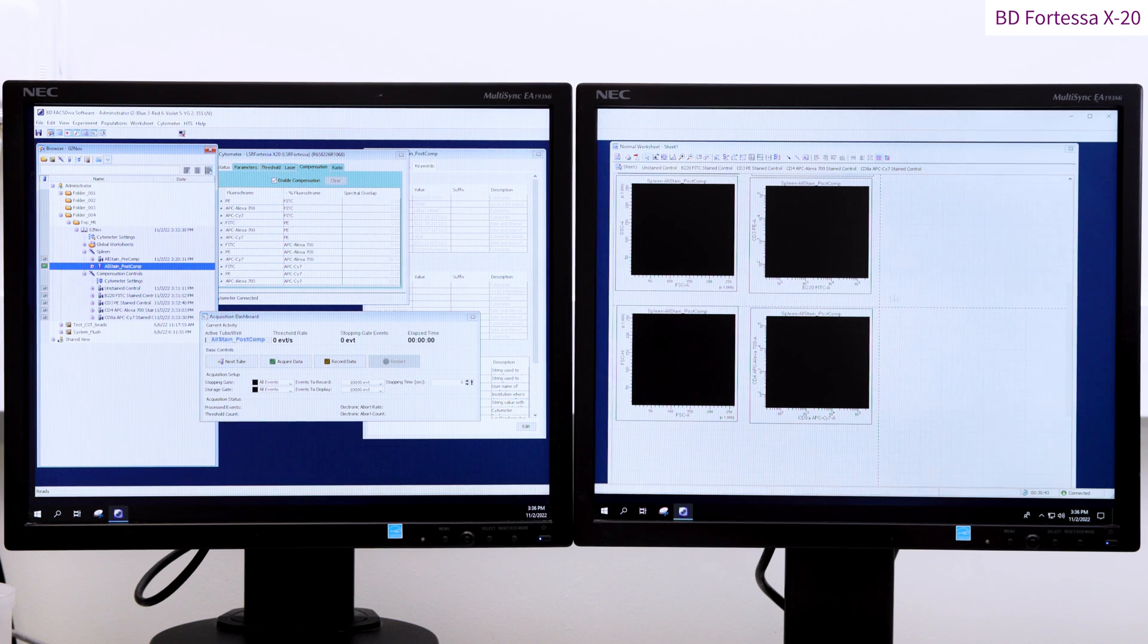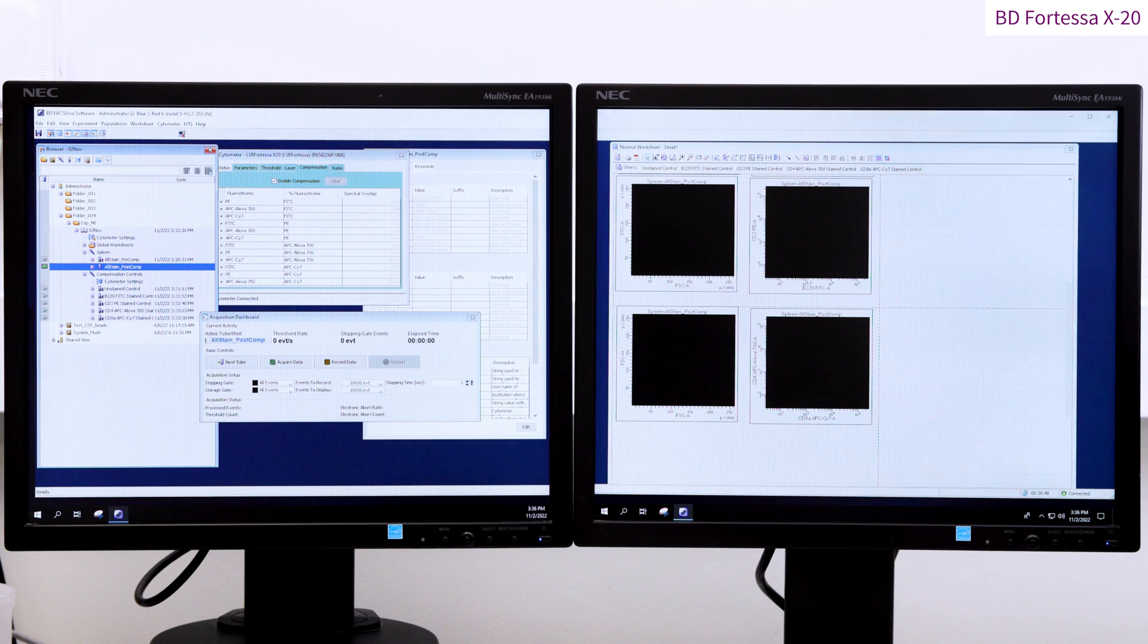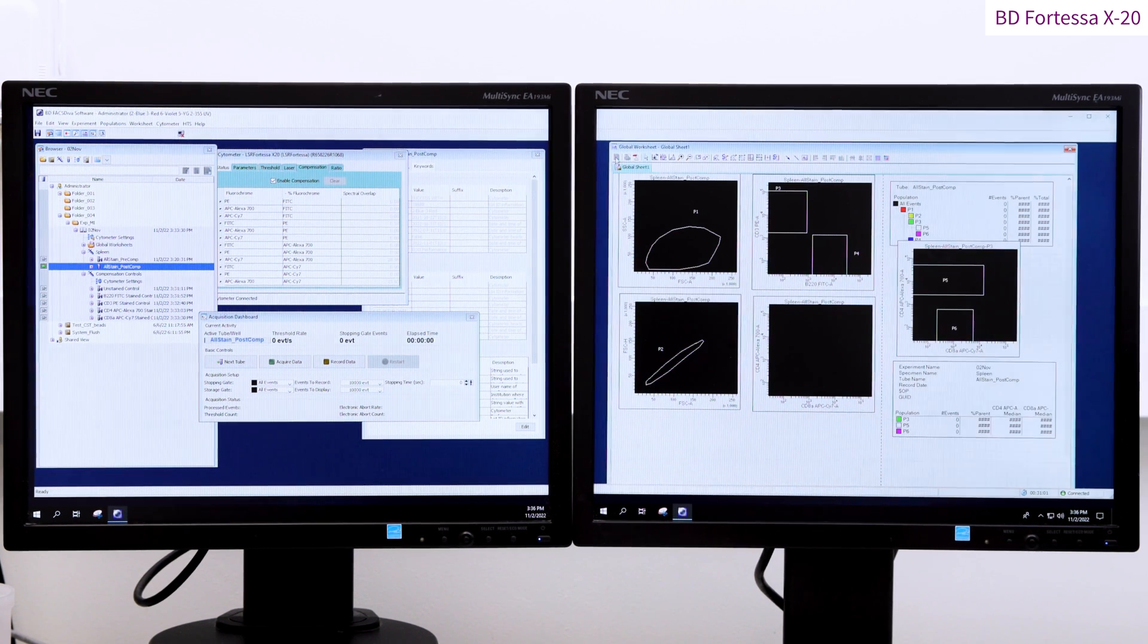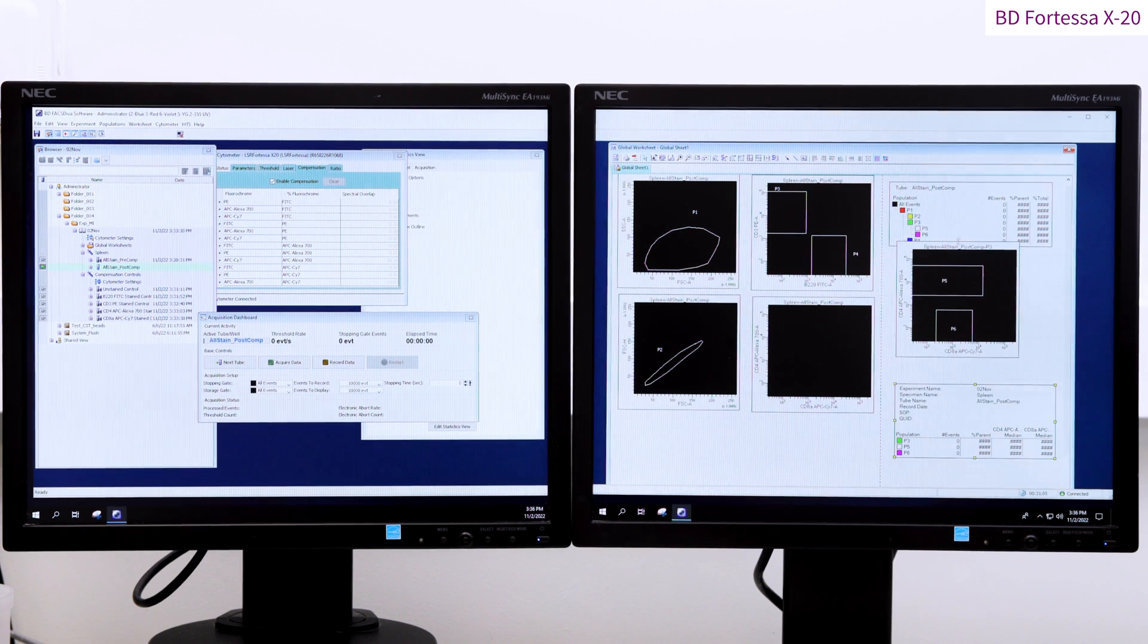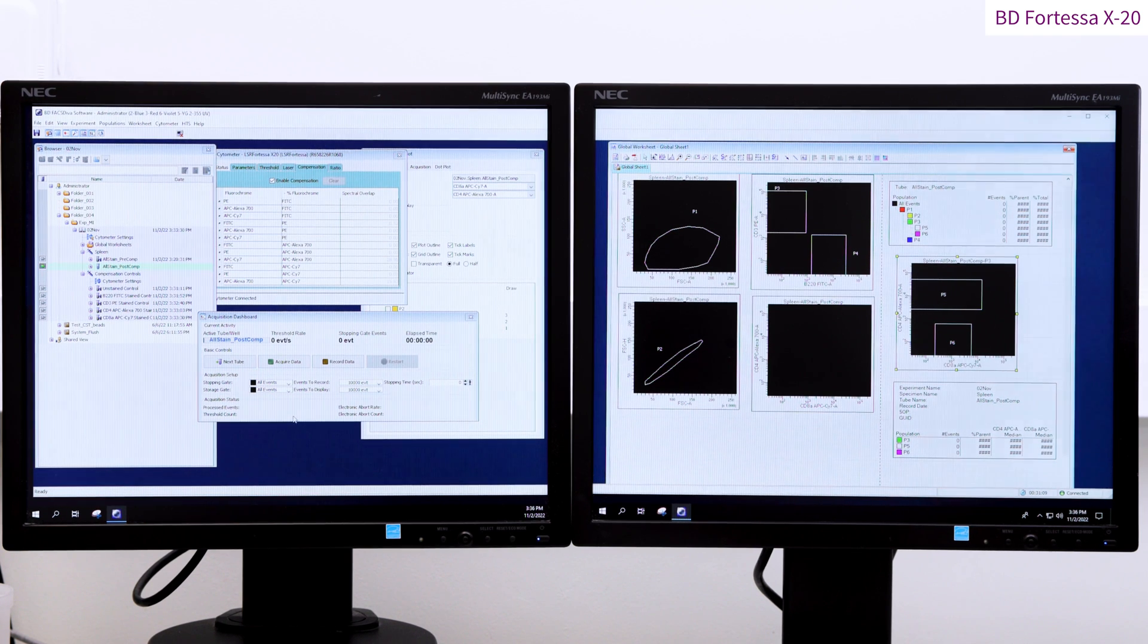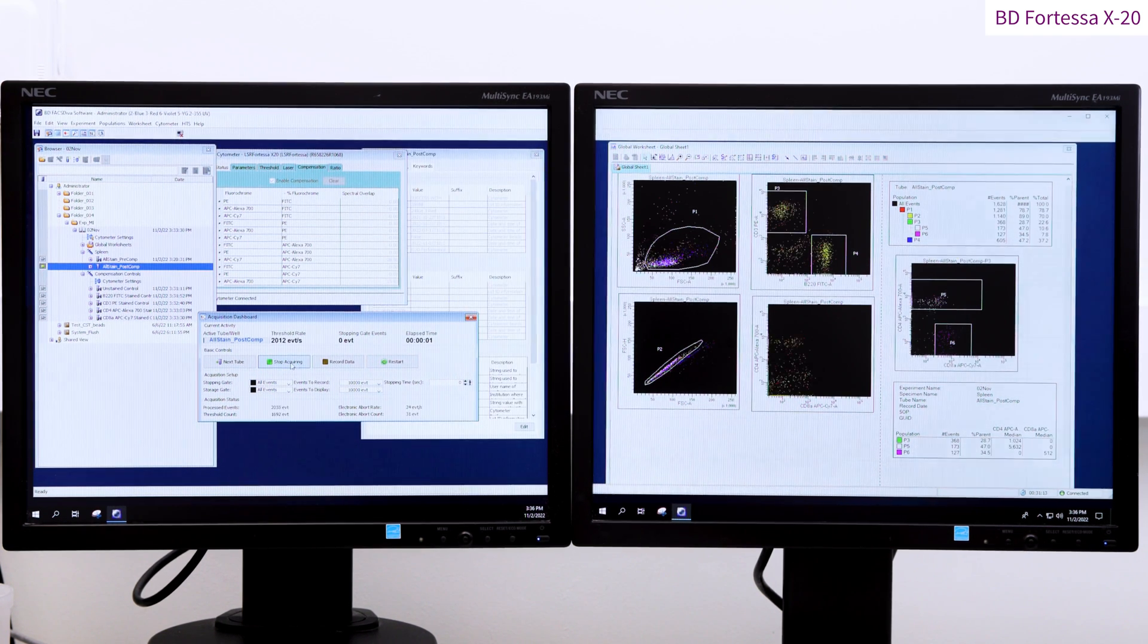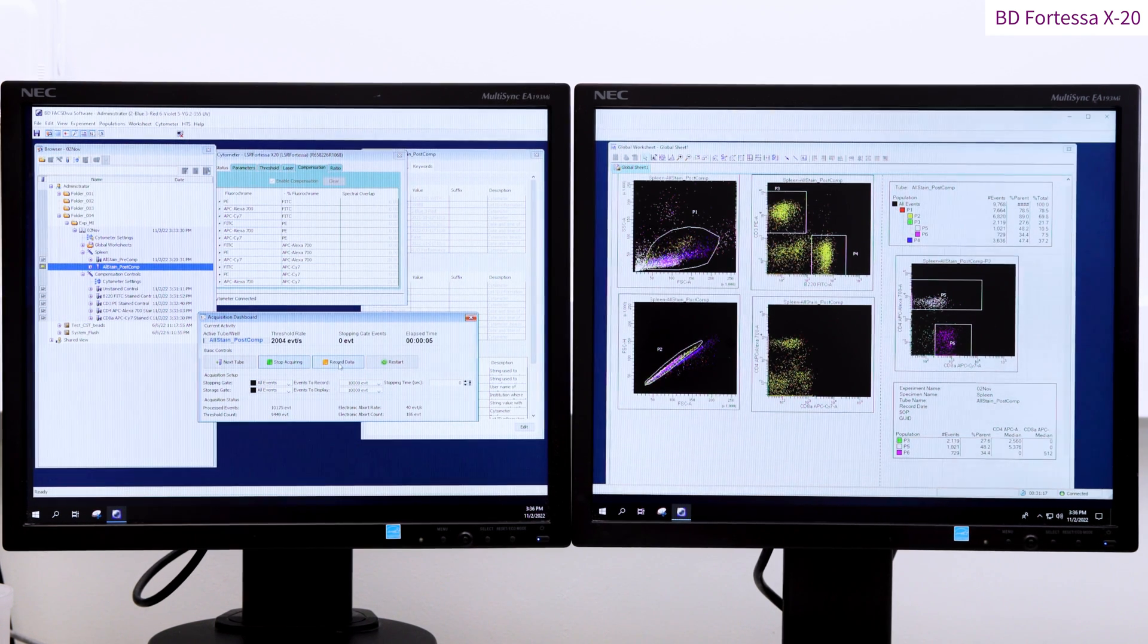We can now record once again our fully stained sample and this time with a compensation matrix applied. We need to leave the normal worksheet and return to the global worksheet before recording our sample. Now recording the sample with a compensation matrix, we can see the CD4 positive population is CD8 negative in contrast to the uncompensated sample.